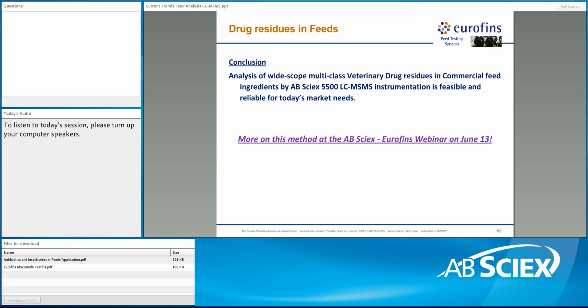Some of our customers have asked us to verify the presence or absence of protein at low levels in their products, since their products are not proteinaceous products, and they've asked us to develop amino acid methods possibly as a measure of trace amounts of proteins in products where proteins are not expected to occur. But we don't currently see LC-MS as really being a very big vehicle for the analysis of feeds, unless there are particular amino acids that occur at low levels that are of interest.